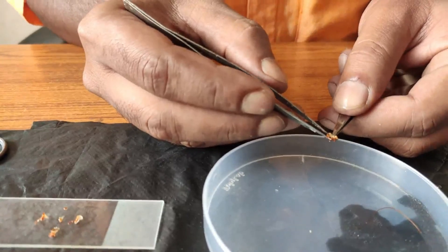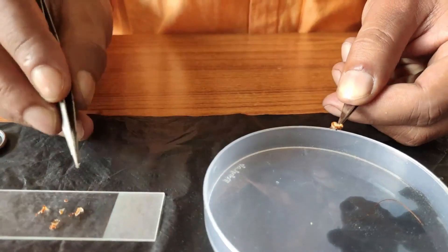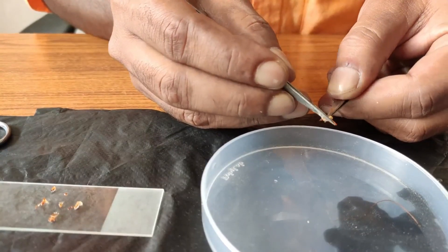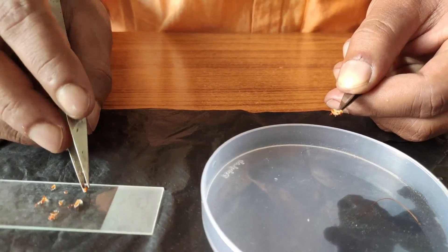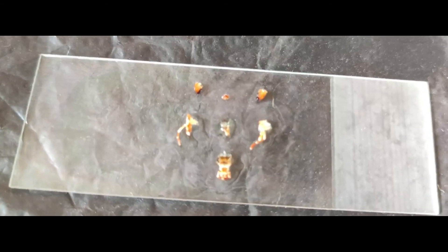Now I am pulling out the two mandibles which are visible here and placing them on the slide. This is the mandible. Now all the appendages have been successfully dissected, removed, and placed on the slides chronologically.